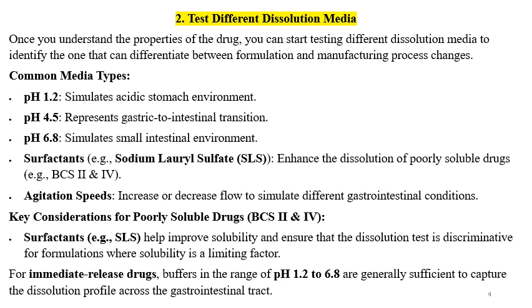Surfactants can be used if the APIs are insoluble and if the sink conditions are not met. Surfactants like sodium lauryl sulfate enhance the dissolution of poorly soluble drugs like BCS class 2 and 4. Then know the agitation speed, increase or decrease flow to simulate different GI conditions. Generally, the standard dissolution conditions are selected like basket apparatus, paddle apparatus with the media volume of 500 ml to 900 ml or 1000 ml.